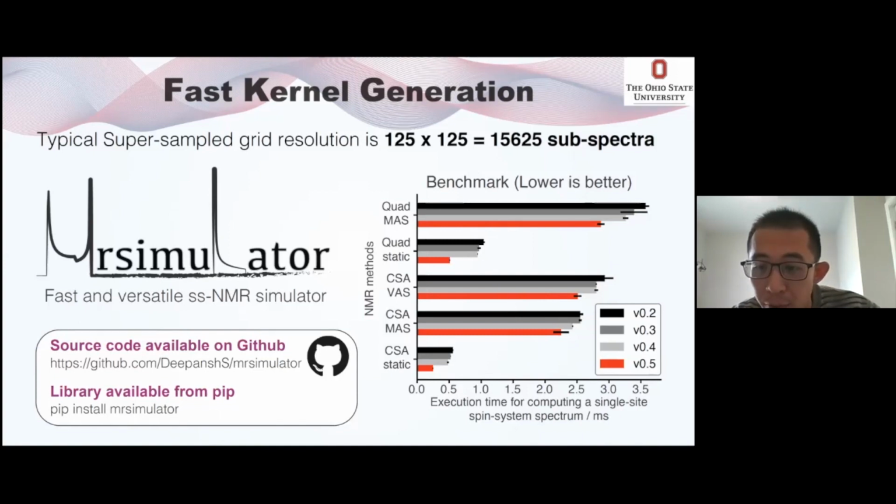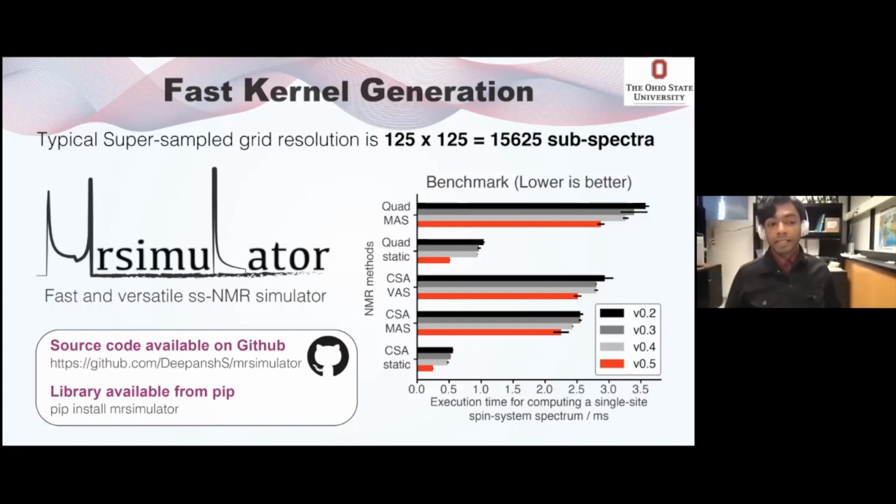Yes. The fact is all these are ill-posed problems. For one, there is no exact solution. What we can get is a near solution. We can approach the right answer, but we cannot get to the right answer. That's the hard truth of the problem itself. And the second thing is the regularization can get you close to the solution, but depending on what regularization you choose, you can end up with different kinds of solutions.